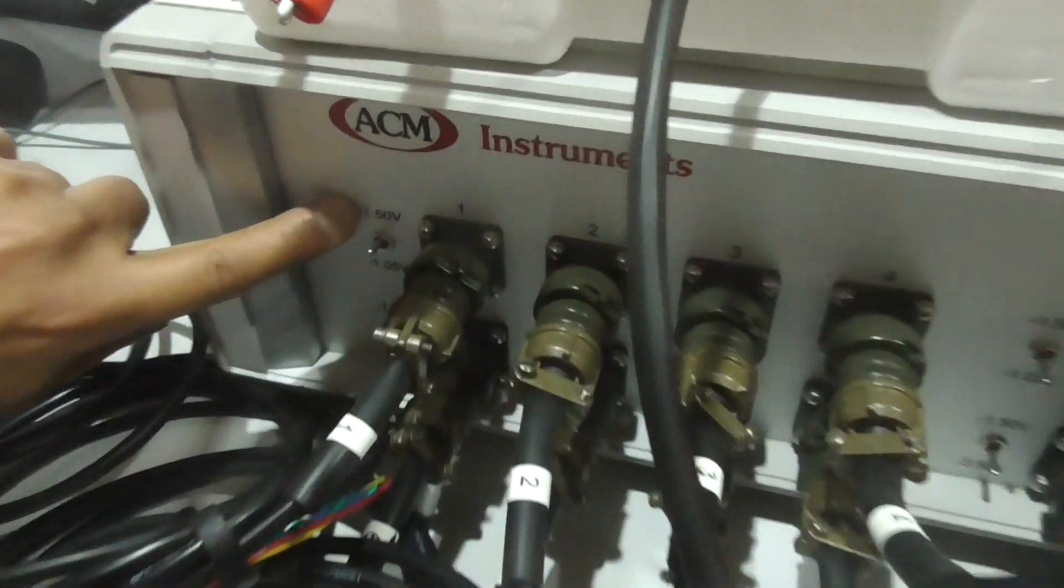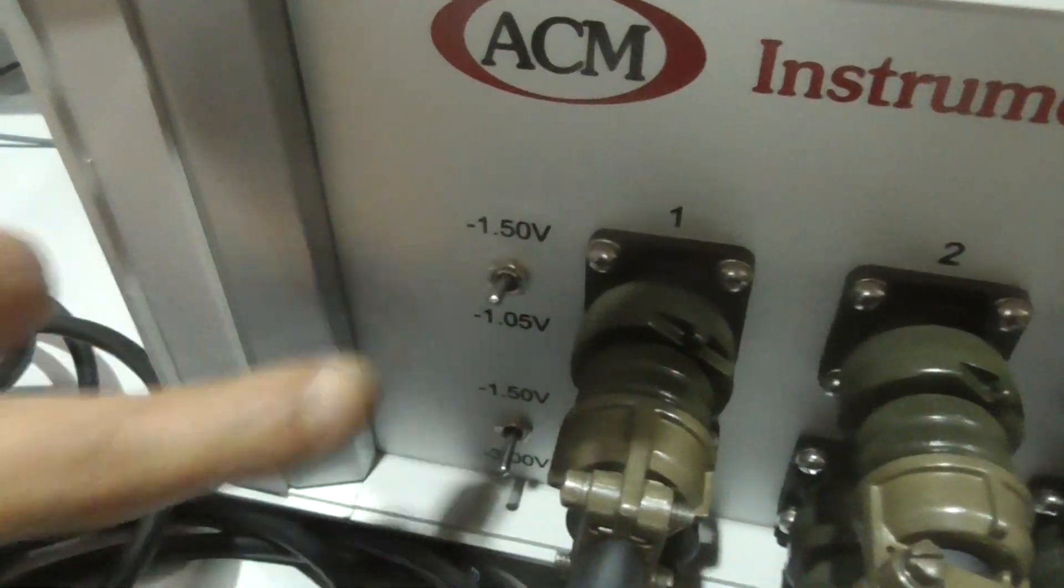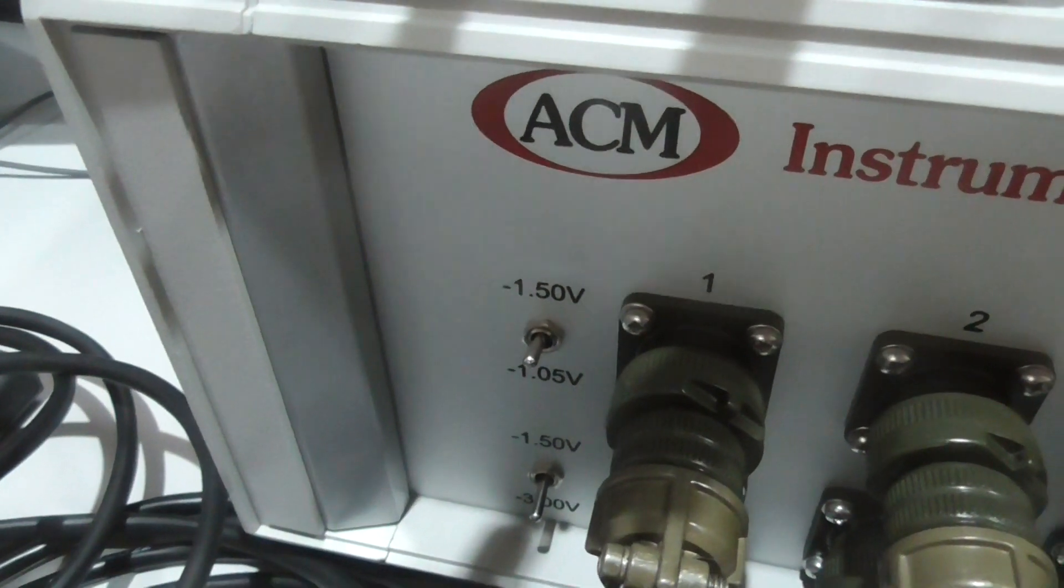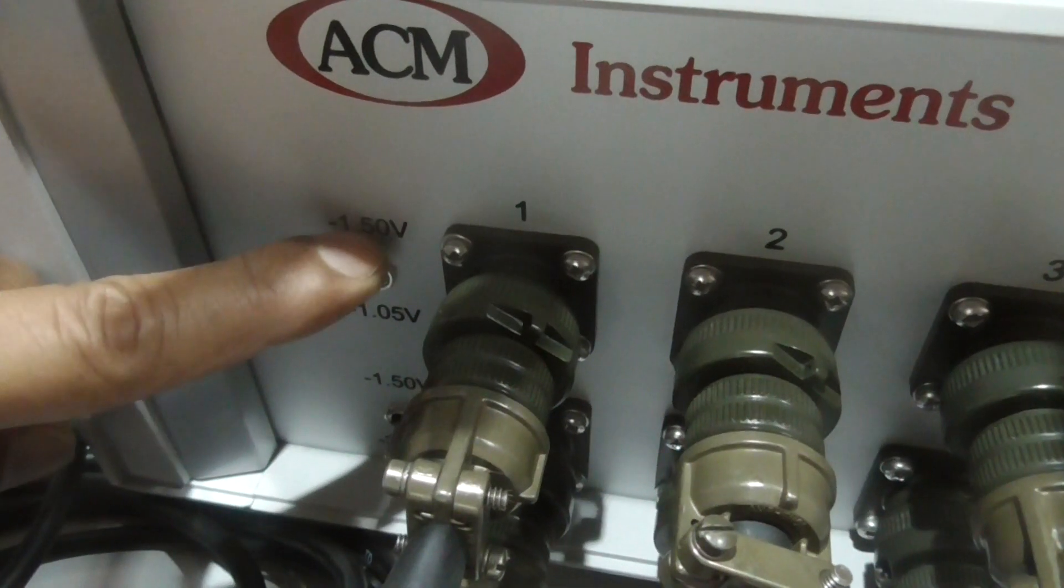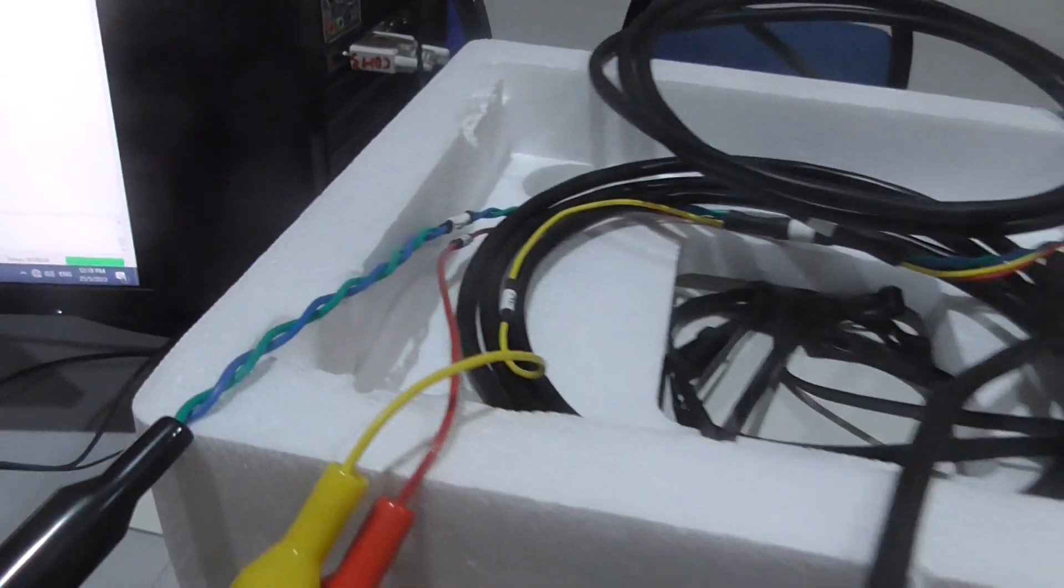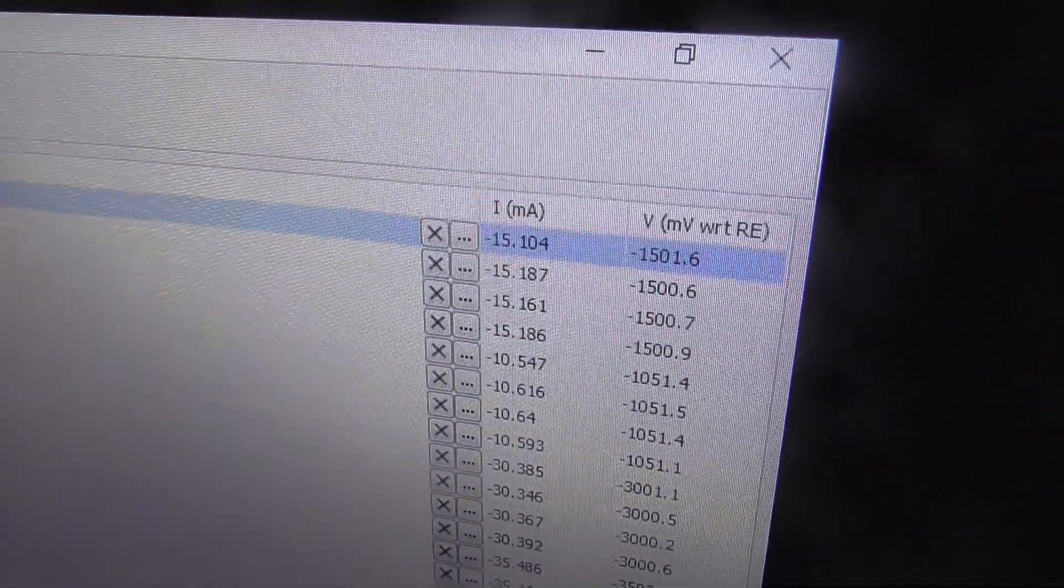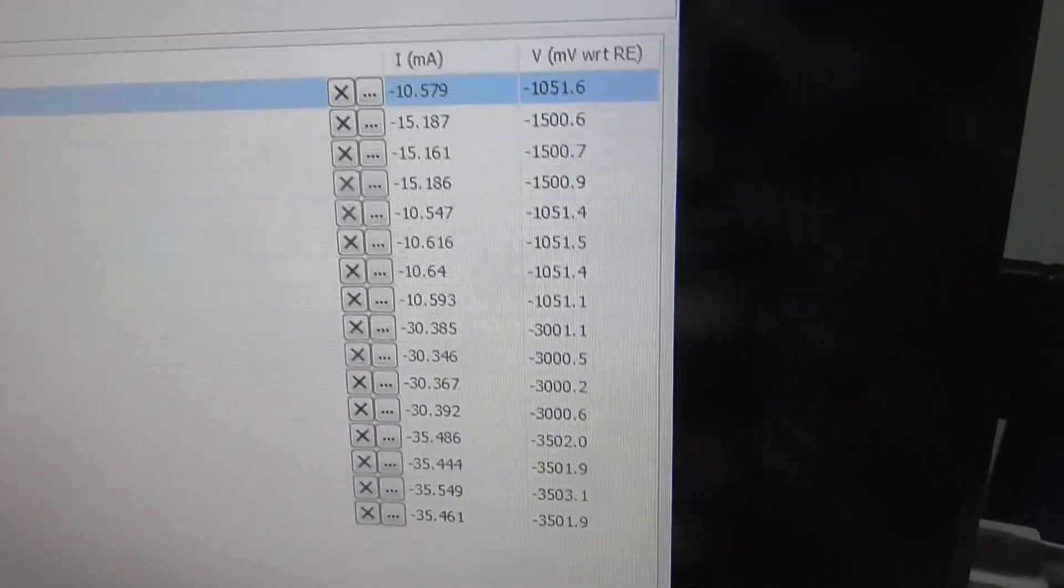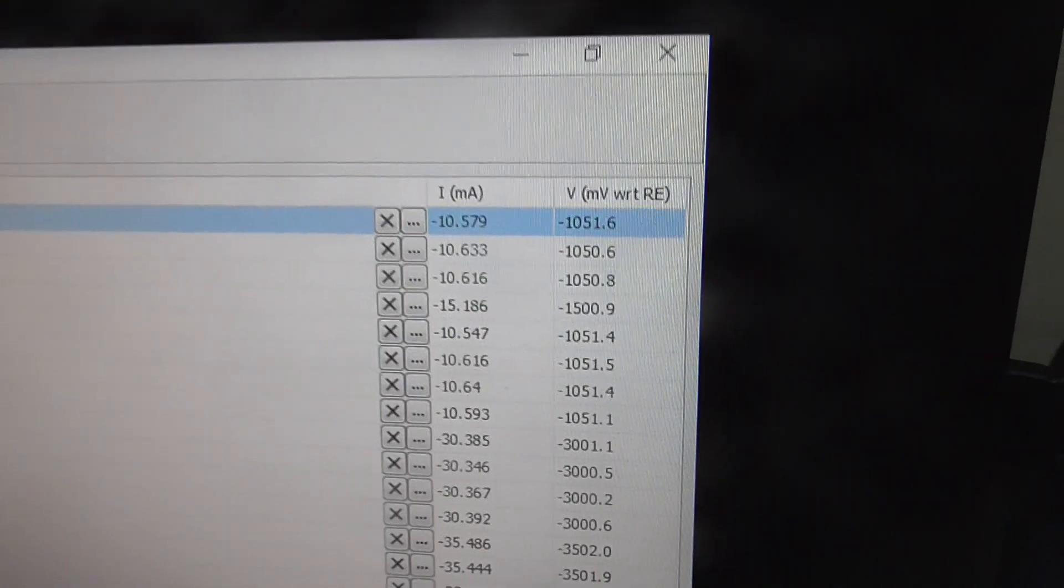You set and you want to stop it and you stop. Let's say you just change the channel. Now it's 1.5 volt and you can see here 1.5. But if now it's channel 14, I change this channel. I go to 1.05 volts. So it will straight away show here when you open back. Calibrating now, reading channel 1.